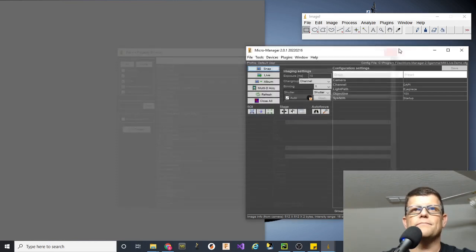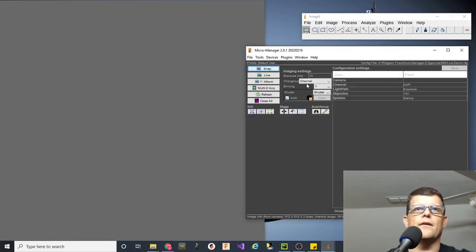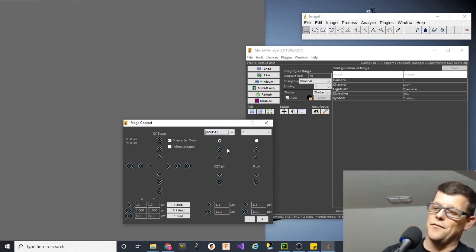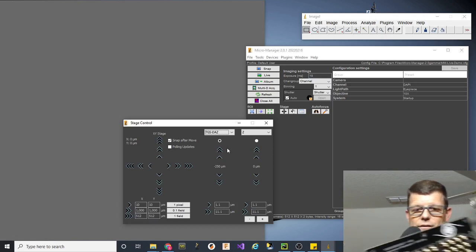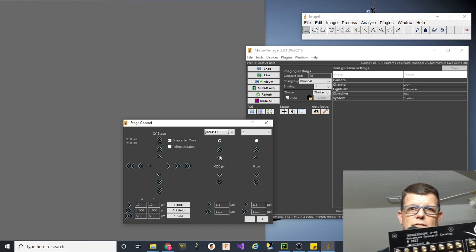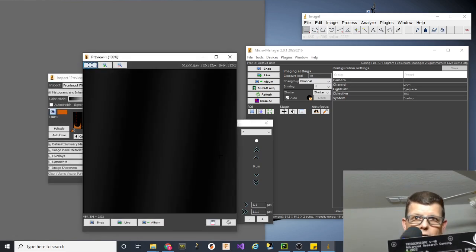It is. And now, if I attempt to drive the stage, I guess you'll have to take my word that it's talking to the Triggerscope, but I'm looking at the LED on the Triggerscope. In fact, this is a unit that's just come out of test. I'll try to show this. Hopefully you guys can see it. There should be a little LED light that lights up as soon as I start to drive this. All right, and indeed it did.